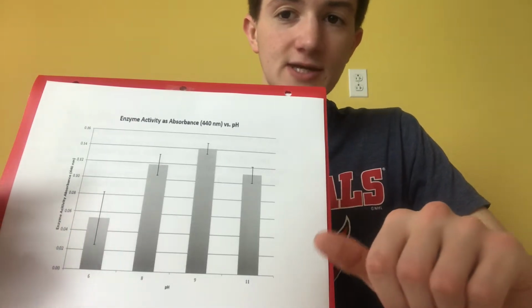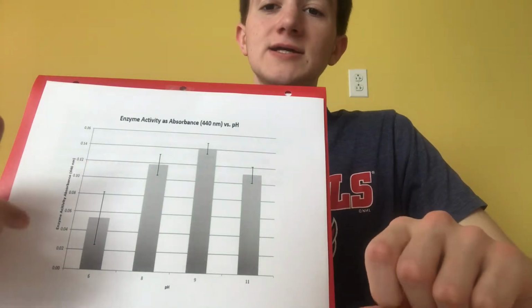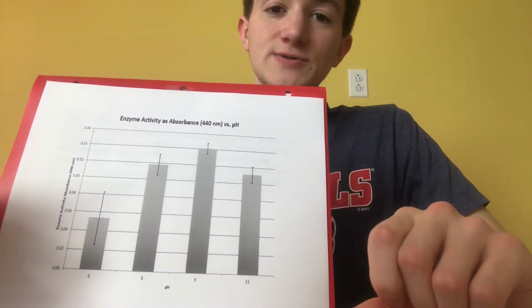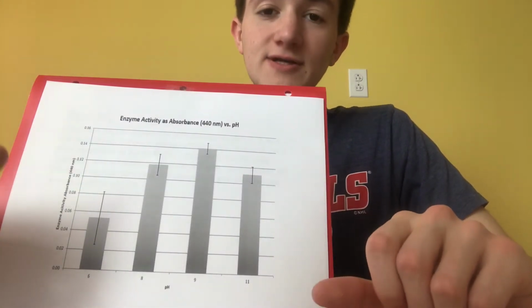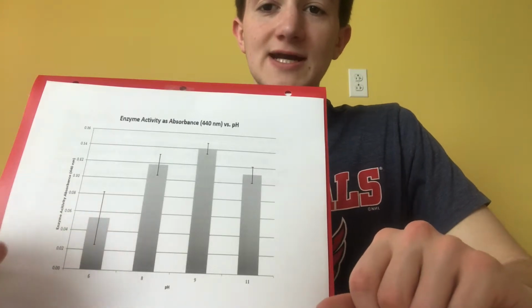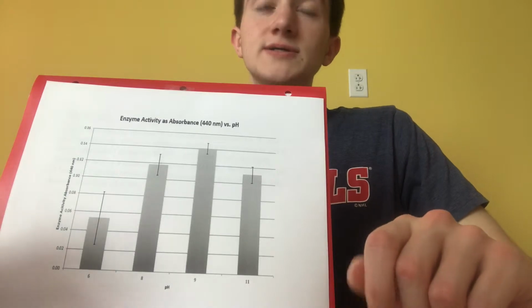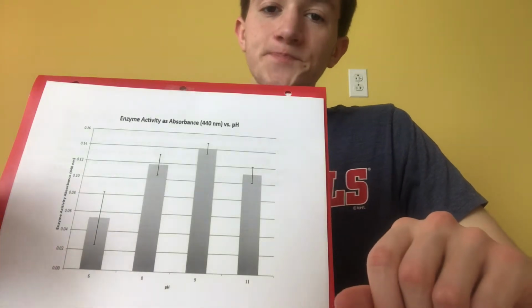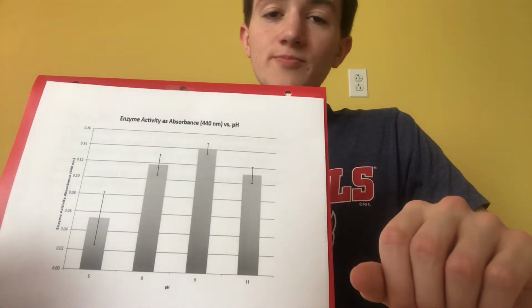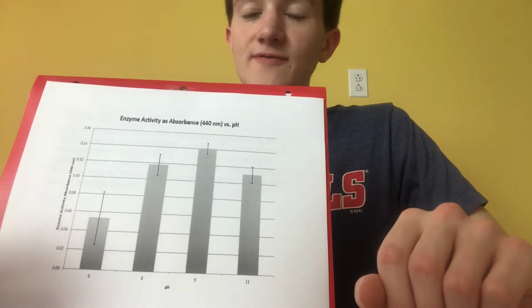As you can see, pH 6 has the lowest absorbance level, and pH 9 has the greatest absorbance level. pH 6 also has the greatest standard deviation at 0.029, while pH 9 has the lowest standard deviation at 0.007. pH 9 has a normalized average of 0.14, while pH 6 has a normalized average of 0.05.